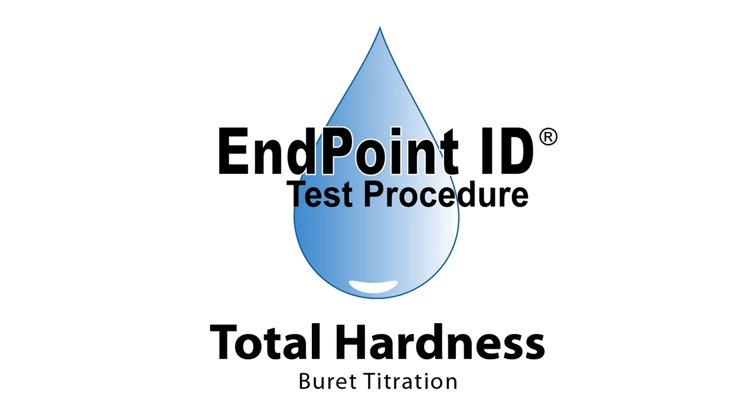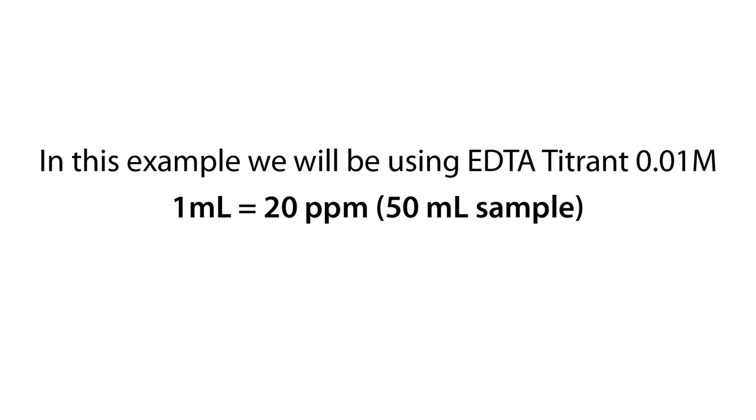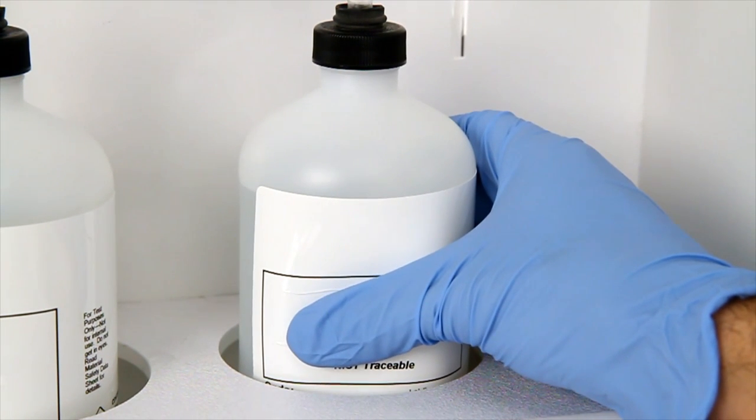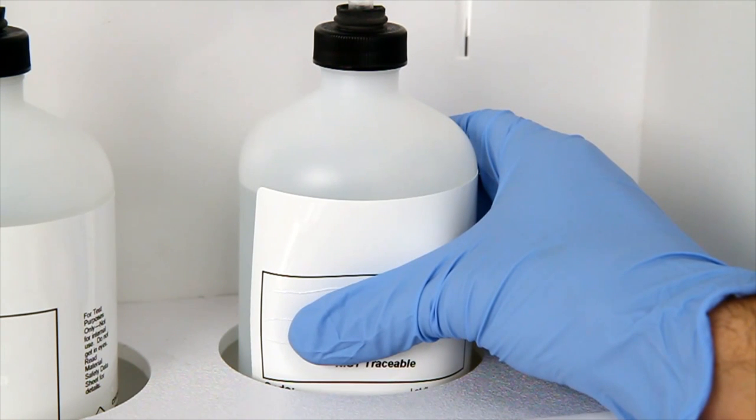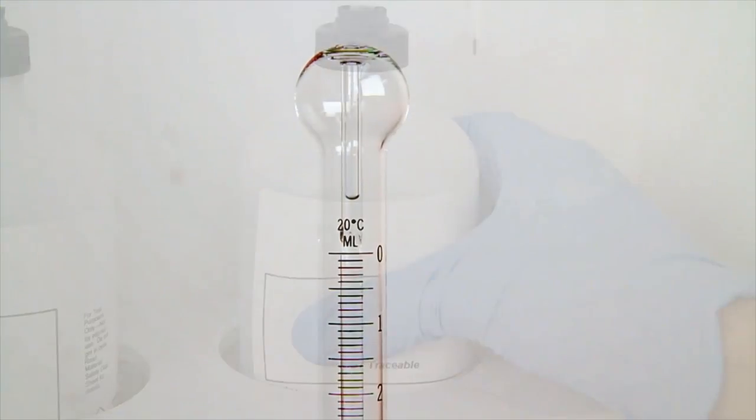This is a demonstration of a total hardness burette titration. The first step is to fill and zero the burette with EDTA titrant. Zero the burette by squeezing the bottle until the titrant reaches the zero mark.